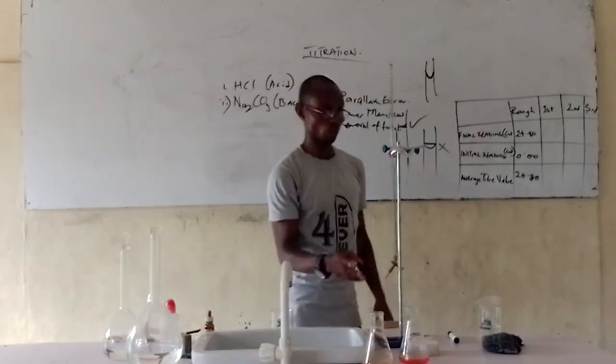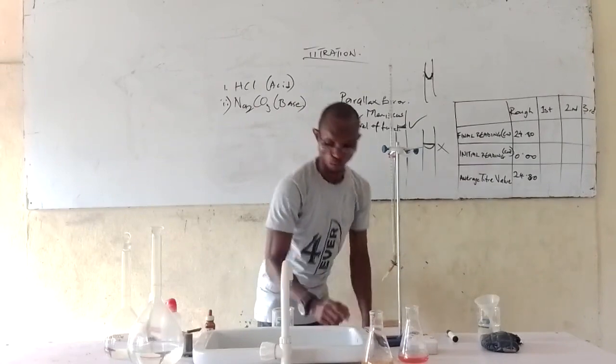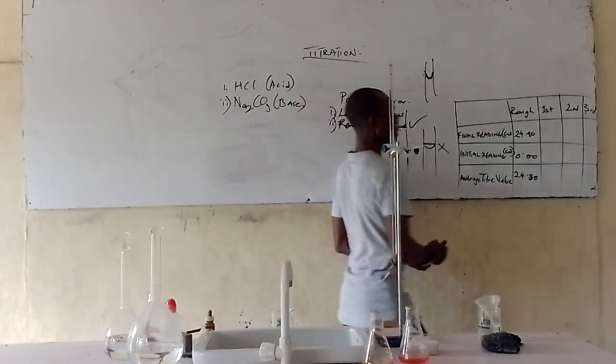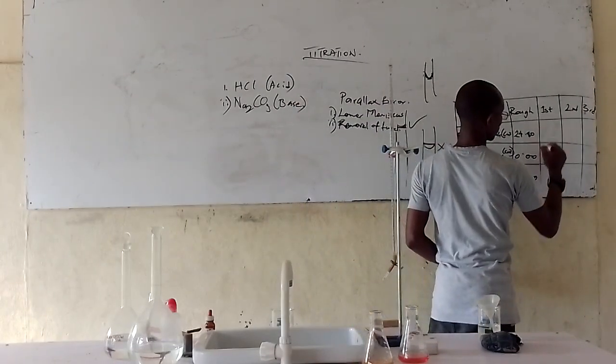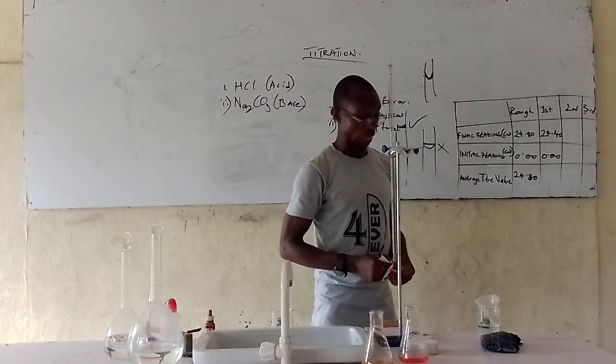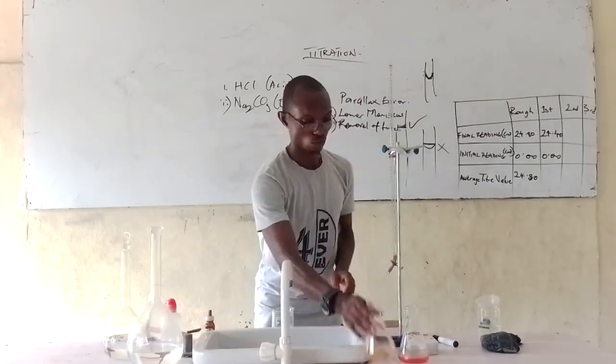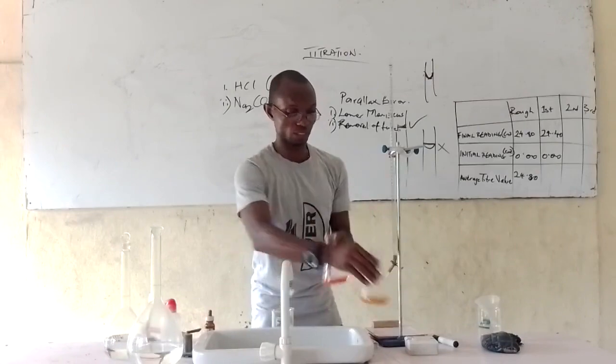At this point, it's giving us 24.4. That is what we have here, 0.00, and here we have 24.4. So let us take 2 more readings. Let me dispense this one.